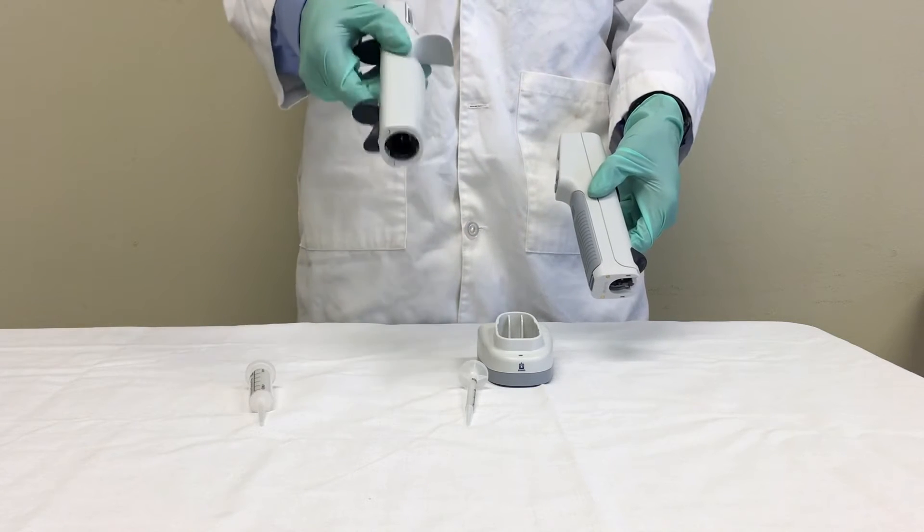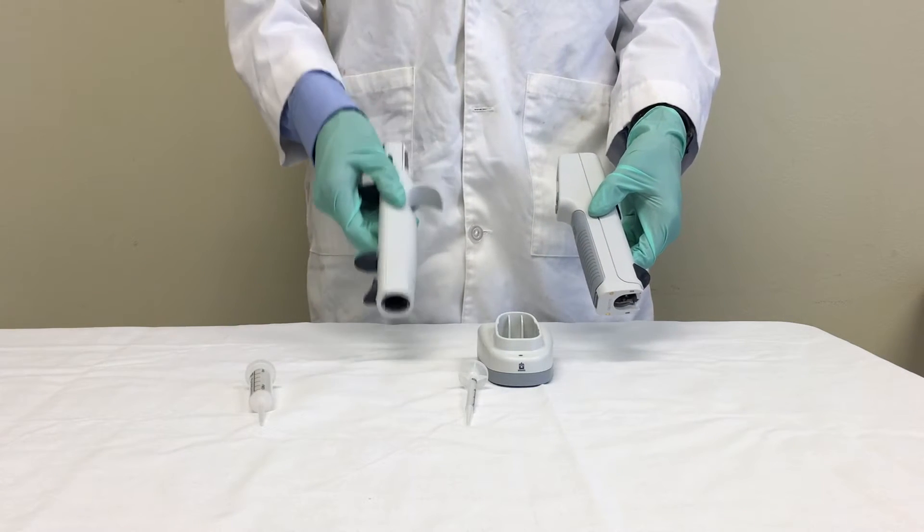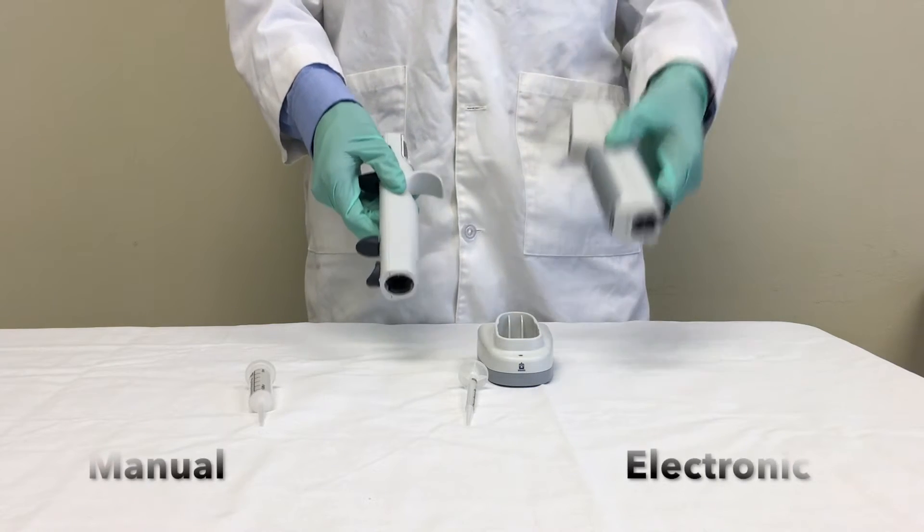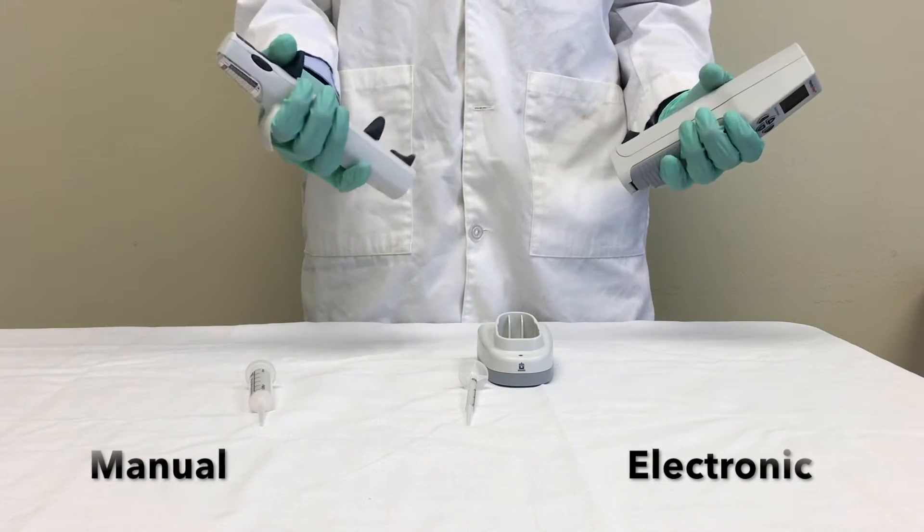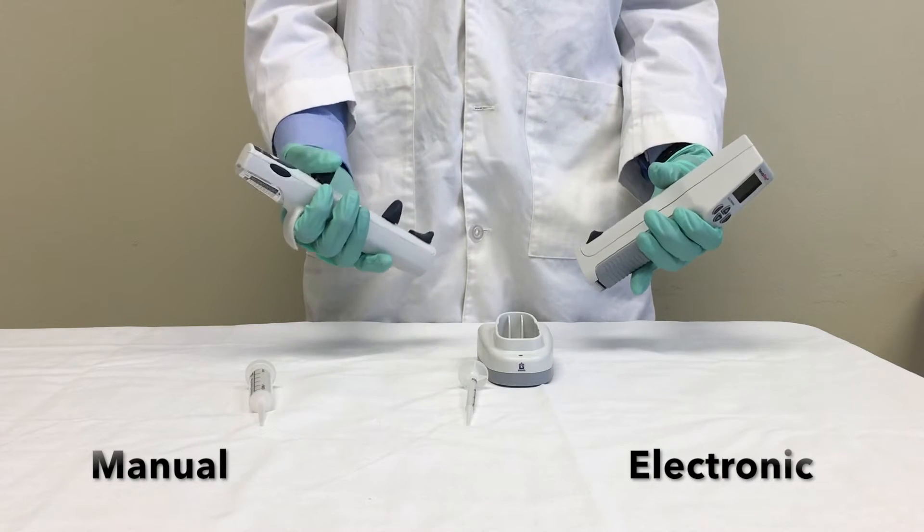We offer two types of repeating pipettes here at Sycamore: the Brandtek Manual HandyStep S and the Brandtek Electronic HandyStep S. Both are single channel pipettes that can handle up to 50ml of liquid. Both are extremely ergonomic and accurate.